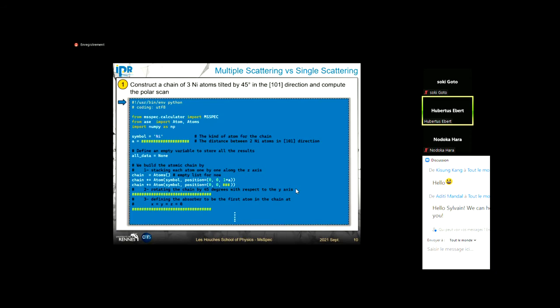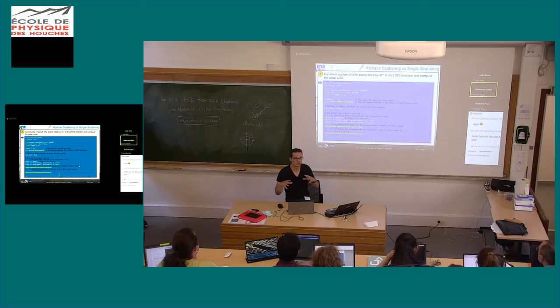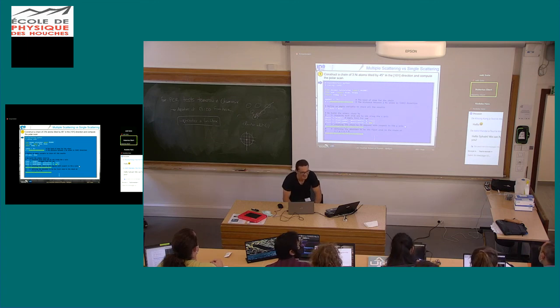So here it is. As it is only your second script, I wrote most everything, but I left some holes in the source code. So you will have to complete this to produce the results. He didn't say it, but this is an IQ test.